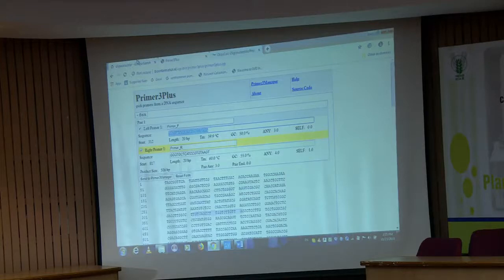I do not know how many of you are handling bacterial or fungal samples, or maybe virus, but let us suppose you must have studied the 16S rDNA amplification. That is basically for bacterial identification. For fungal identification, we go with the ITS identification.